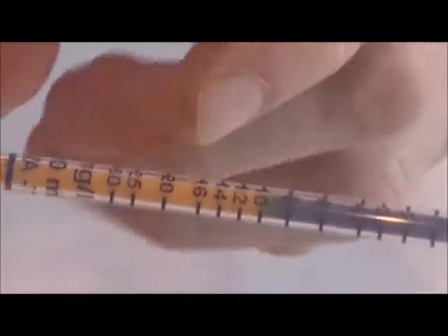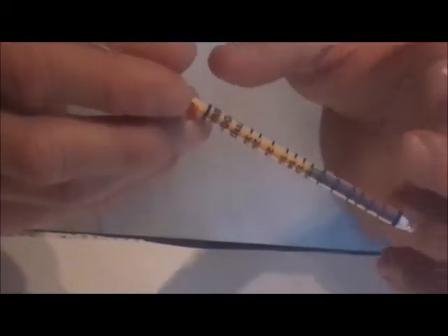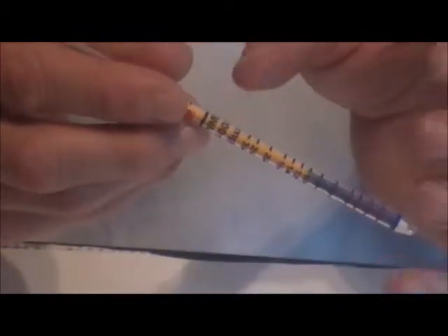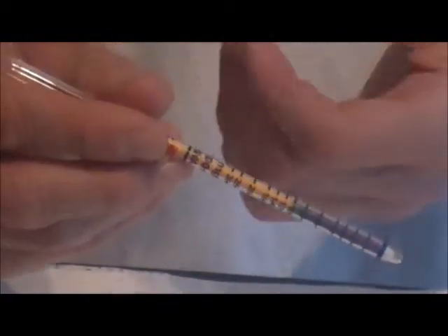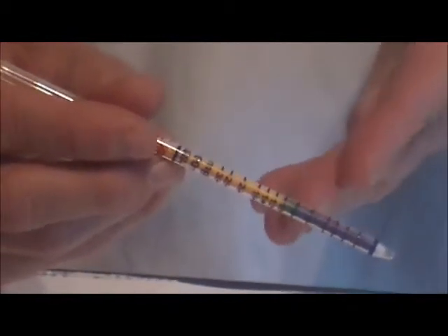If the stain is slanted, take the average of the longest and shortest points. It is best to read the tubes immediately after making the measurements. Although most tubes have a stable stain that will remain for hours or days, some tubes will diffuse or disperse — for example, water vapor will keep entering the tube and give a longer stain with time. Therefore, make the measurement immediately after taking the sample gas through the tube.